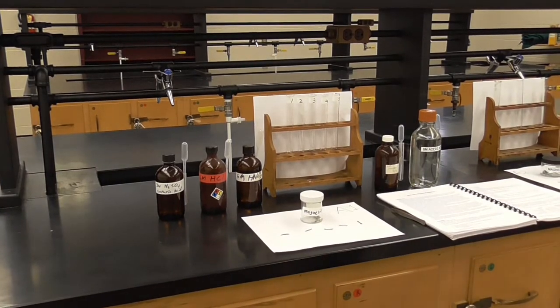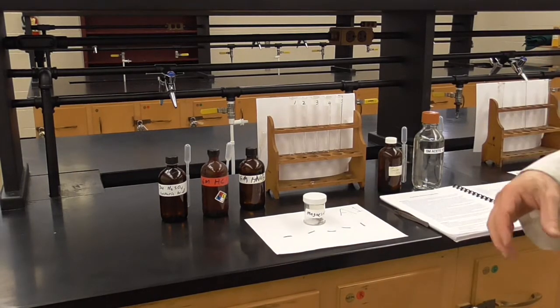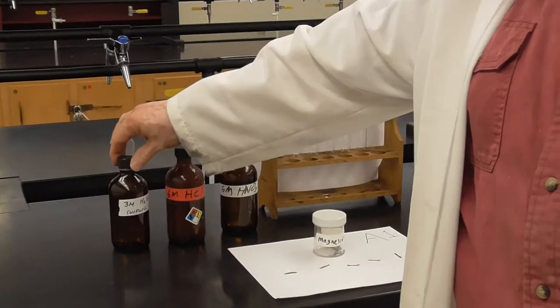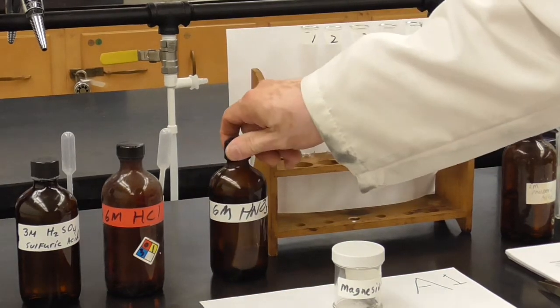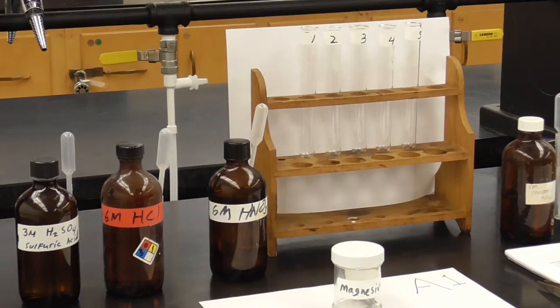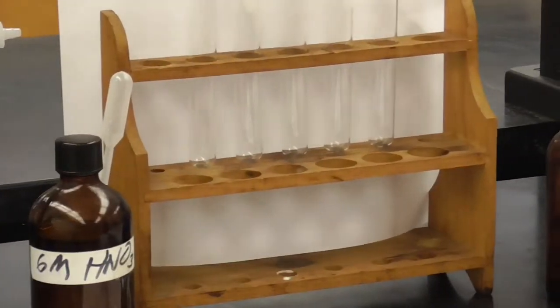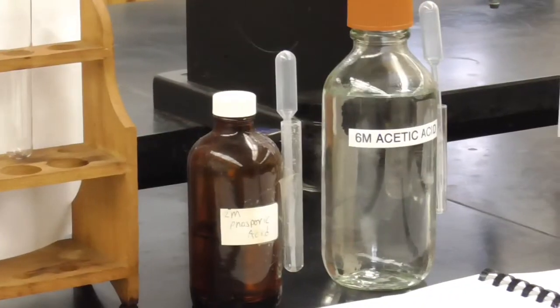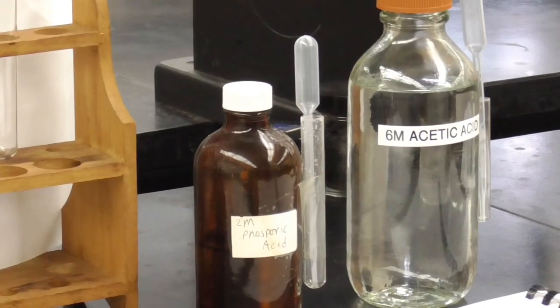And we do have different concentrations on these. So for example, this is 6 molar. And so 6 protons would come off, 6 molar, if that was totally dissociated. This one has 2 protons that could come off, so we have that at 3 molar. 3 times 2 is also 6. Nitric acid, there's only 1 proton that comes off, so it's 6 molar as well. So we're keeping the reactivity, as far as the number of protons that can come off, the same in each case. Phosphoric acid actually has 3, and so we're doing a 2 molar solution there. And acetic acid, again, has 1, and so we have a 6 molar. So they are on the same field as far as their concentrations and the number of protons that can come off. So we've leveled that off. I hope that makes sense.